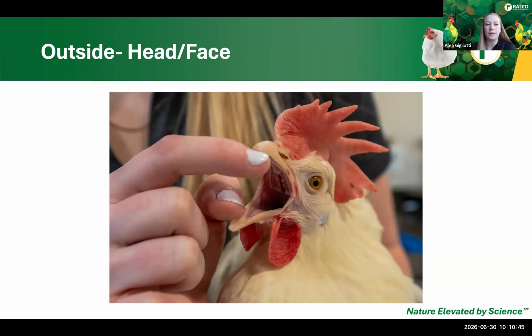Moving on to the mouth, inside of your mouth should be free of any mucus, inflammation, or any kind of buildup or plaques. Mycotoxins, for example, can lead to some lesions that look almost like necrosis in the mouth. And so if you're seeing any of those types of lesions, that's a sign that you may have mycotoxin contamination in your feed.